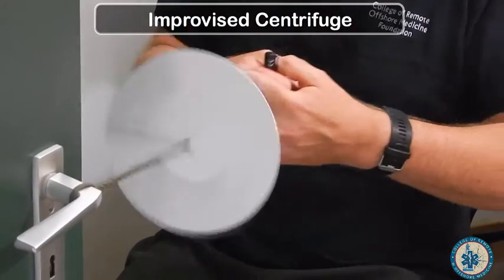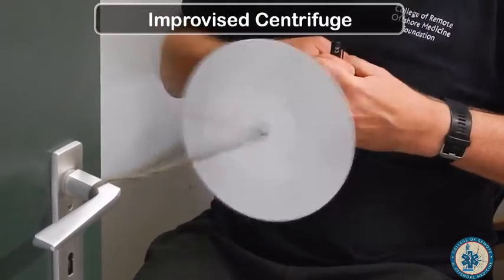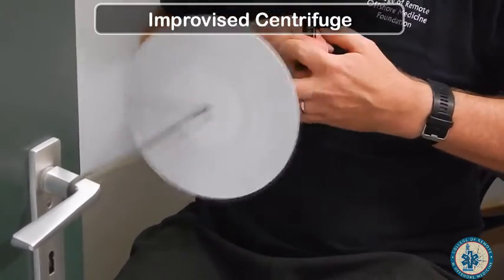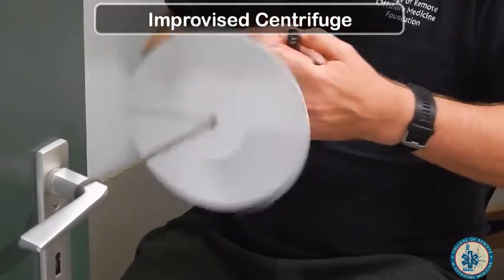Next, you're going to spin this for five to six minutes. You are going to attach one end of your string to a stationary object and pull rhythmically on the other end, having this spin back and forth, back and forth.